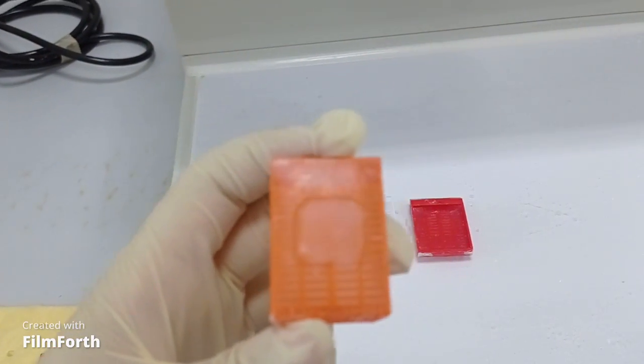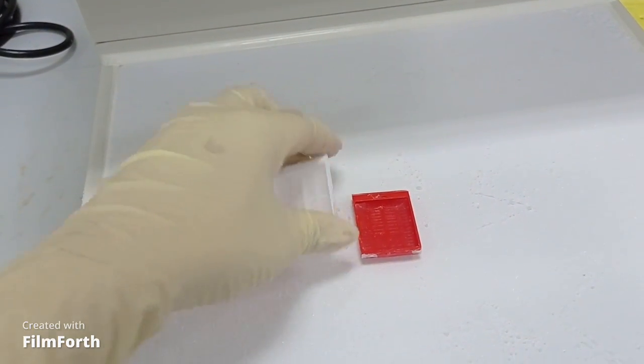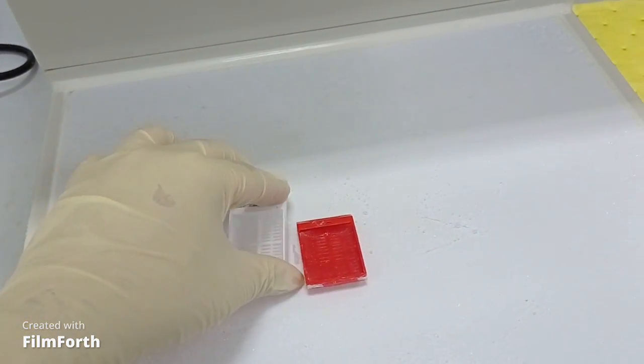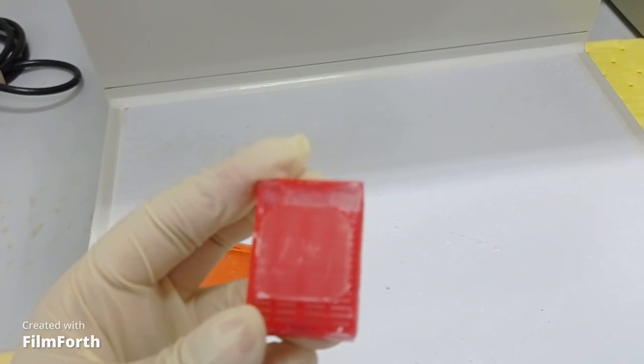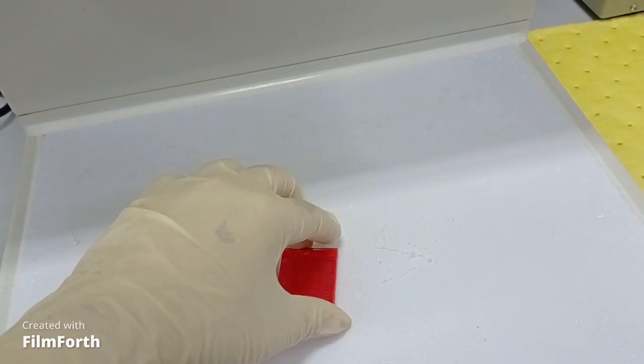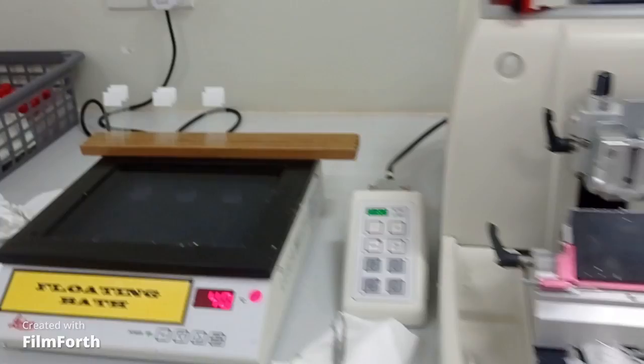As you can see in this section, I already put my breast cancer blocks on the cooling plate to cool them down. After that, I will proceed to the microtome machine for microsectioning and trimming. I will do the trimming first and after that I will do the microsectioning.